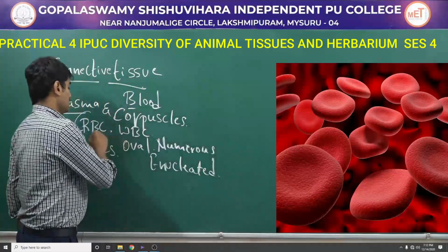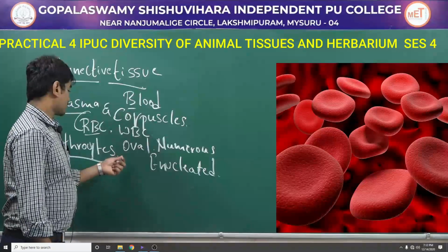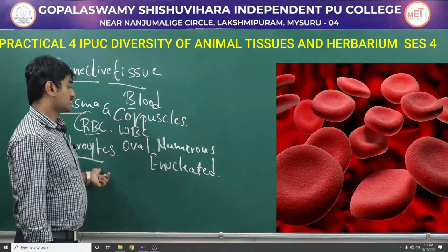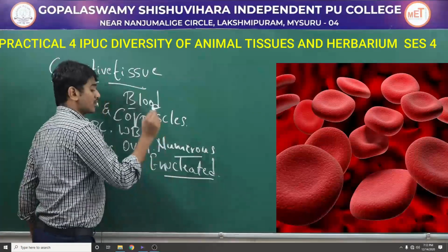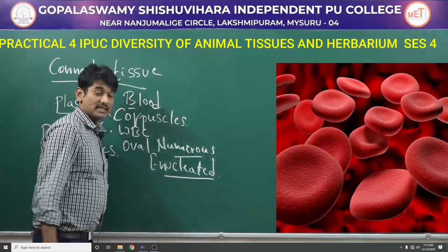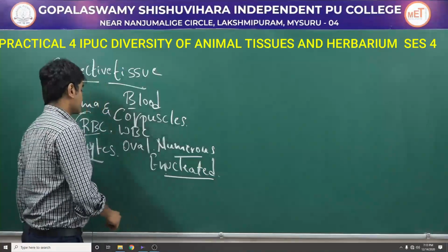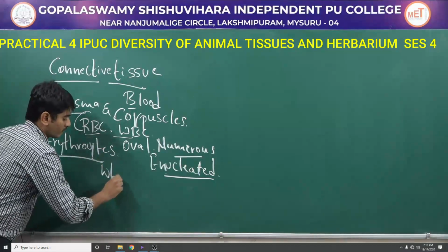RBC is red blood cells, also called erythrocytes, oval in shape, numerous in blood and enucleated, which means absence of nucleus. The next one is WBC, white blood cells.